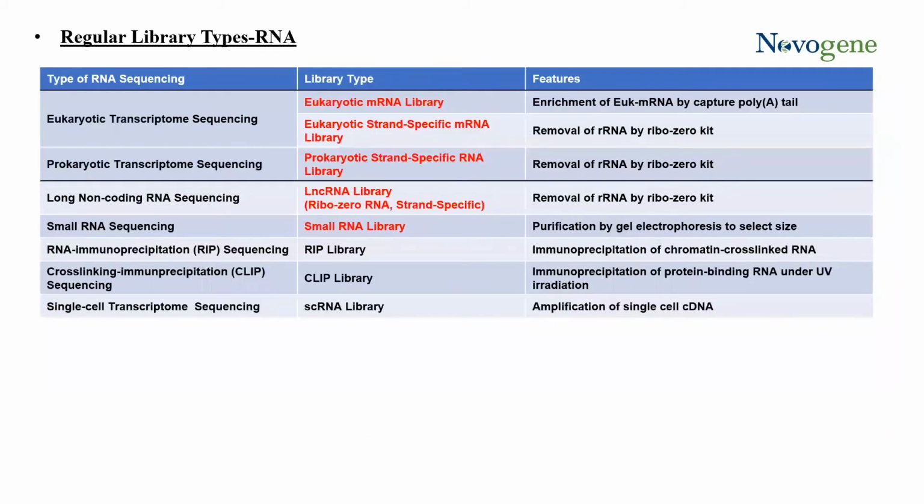So now we jumped into some common RNA types. The RNA world is blowing up right now in NGS services. Really the total RNA, so our long non-coding pipeline, and our eukaryotic pipeline are the most commonly used. And so it's important, once again, to evaluate these library types individually and potentially what is going to be loaded on your lane with it.